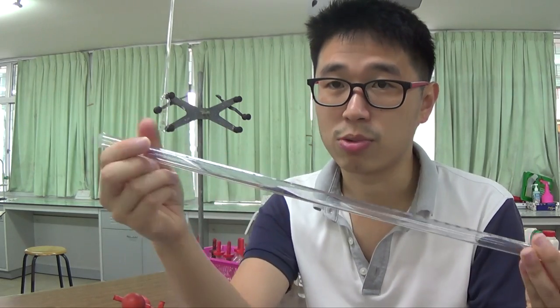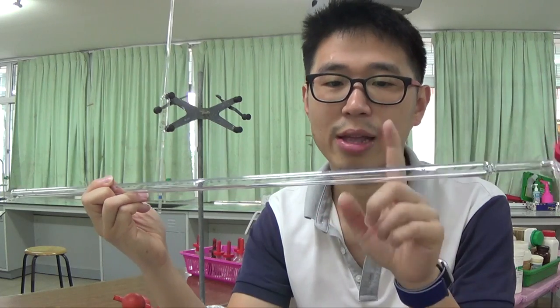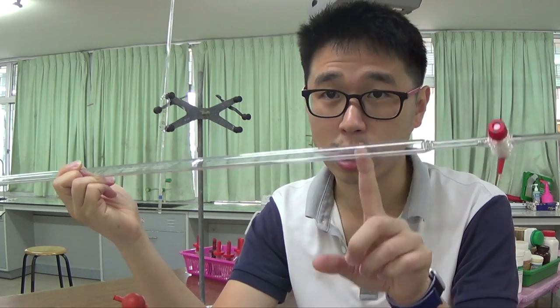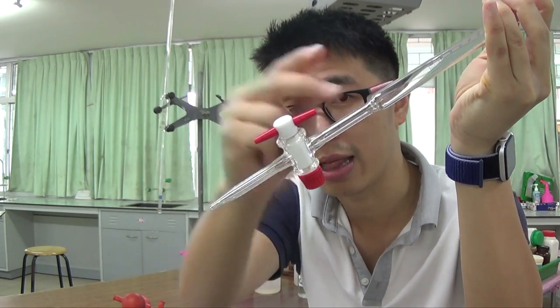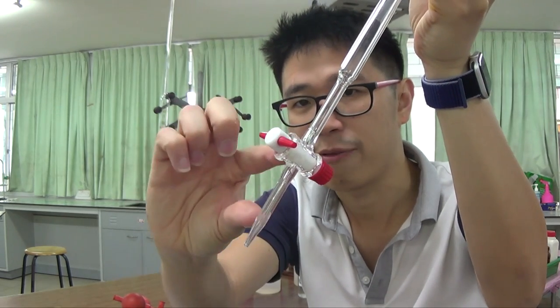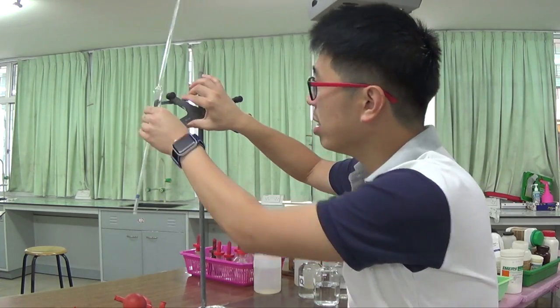What I'll do is, I do not wash my burette with distilled water anymore, because I need to rinse the burette before any use. I need to rinse the burette with the solution that I'm going to fill it with, making sure that I pass some volume down at the bottom. I need to allow the liquid to pass through the bottom and close the tap so that these parts are filled with the liquid in the burette as well. But before I fill it, I have to rinse the burette with the solution that I'm going to use. It's a 50.00 cm cube burette.